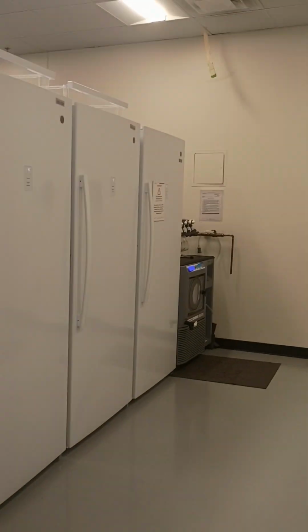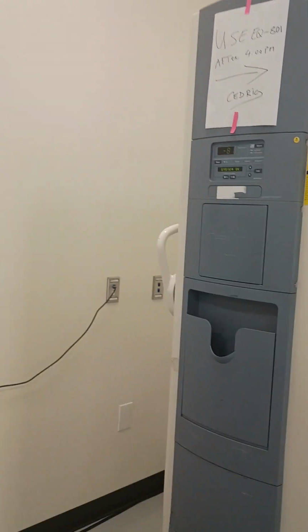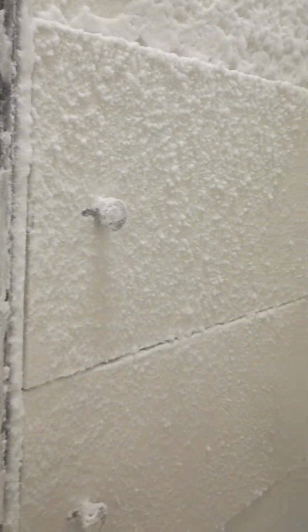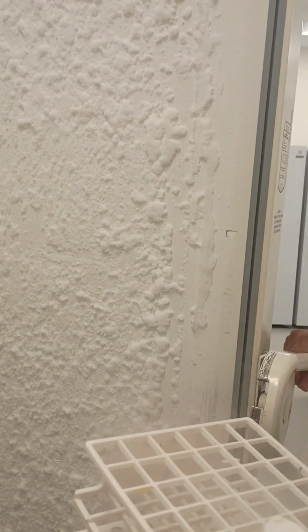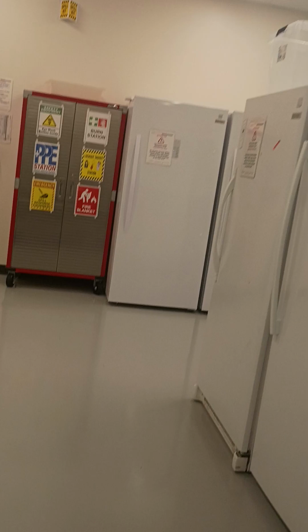This is the minus 40 that I put in your SOP. Perfect example: I did my samples and put them here. This is how they're supposed to look. They're all frozen, ice frozen. If you can close that, please.